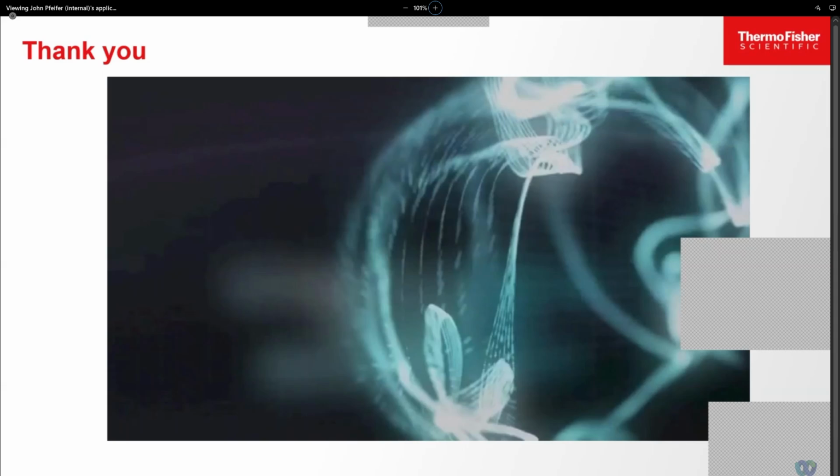But I can make a note that for gene expression, as an example, most of our gene expression assays position the TaqMan probe over an exon-exon junction site. That prevents genomic DNA from being detected. So that's a form of contamination. If you're doing gene expression, you don't want genomic DNA contributing to your results. So the TaqMan probe really helps keep that genomic DNA from participating in the data.